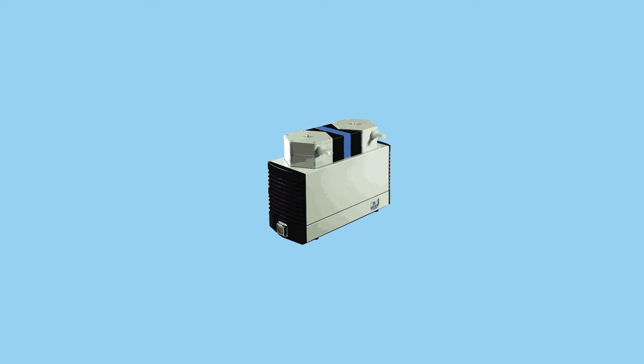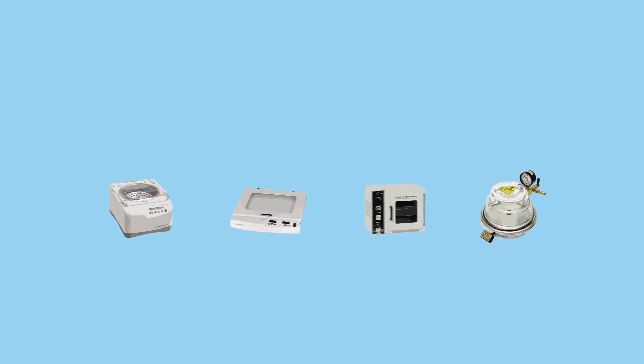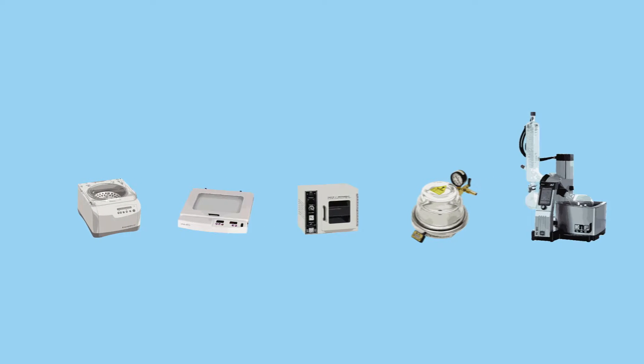To provide suction for aspiration and filtration, and to control vapor pressure for solvent evaporation in concentrators, gel dryers, vacuum ovens, desiccators, and rotary evaporators.